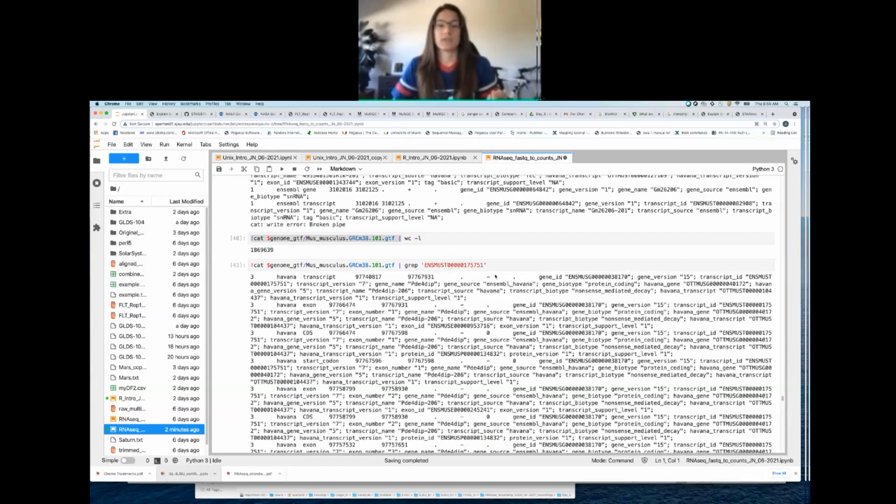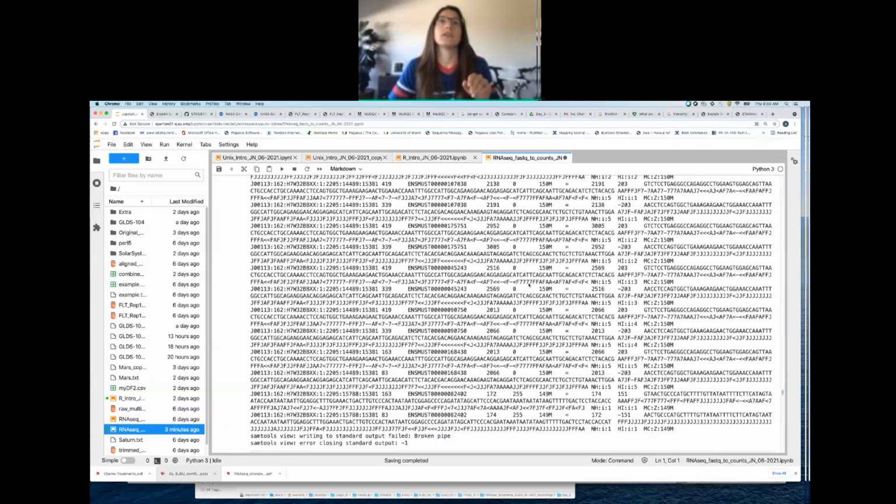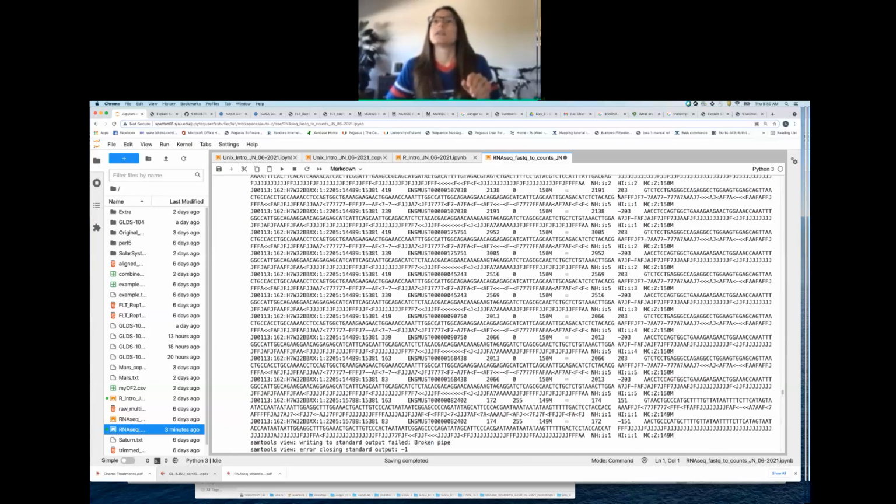So Felix, so far your hypothesis is looking right. This is again that same gene ID that ends in 38170, which tells me that this is a splice isoform of the same gene. So that's the second one. Let's see if that's true for the third one.